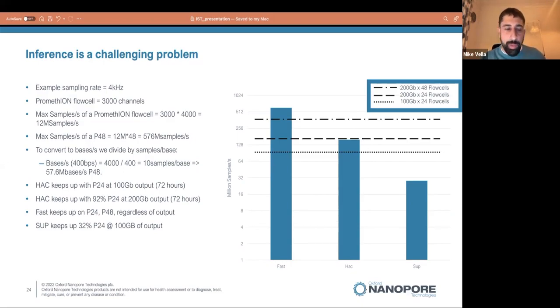If we were Google or Facebook and had that kind of data, it would be a relatively straightforward scaling problem, because they typically run all their machine learning inference in the data center, so you can just buy more GPUs. We can't do that. If you've got a sequencer producing 1 gigabyte a second, you can't offload that quantity of data to the cloud. It's just far too much bandwidth.